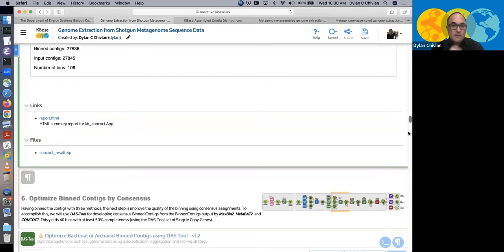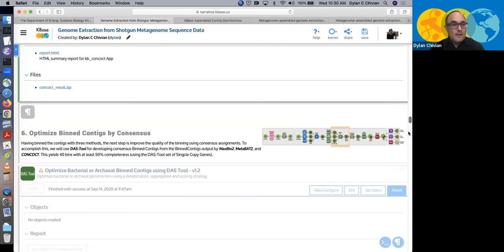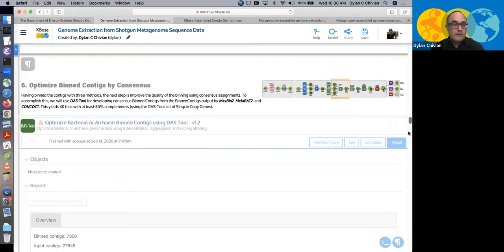But which of them is right? Well, none of them. I should say none of them are perfectly right. So can we improve on what they've got by building a consensus? I'm sure most of you have heard of Jill Banfield.